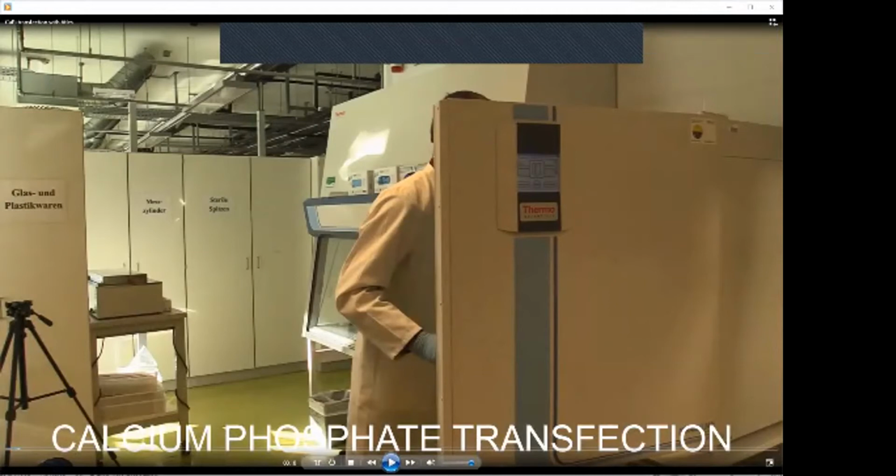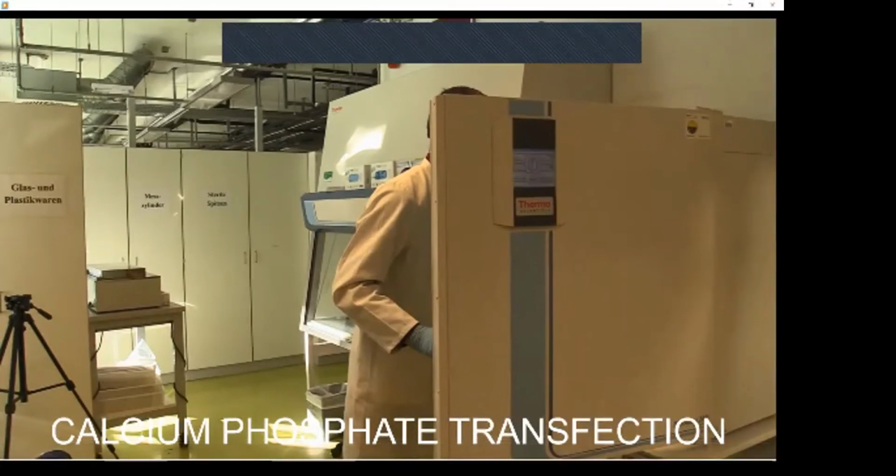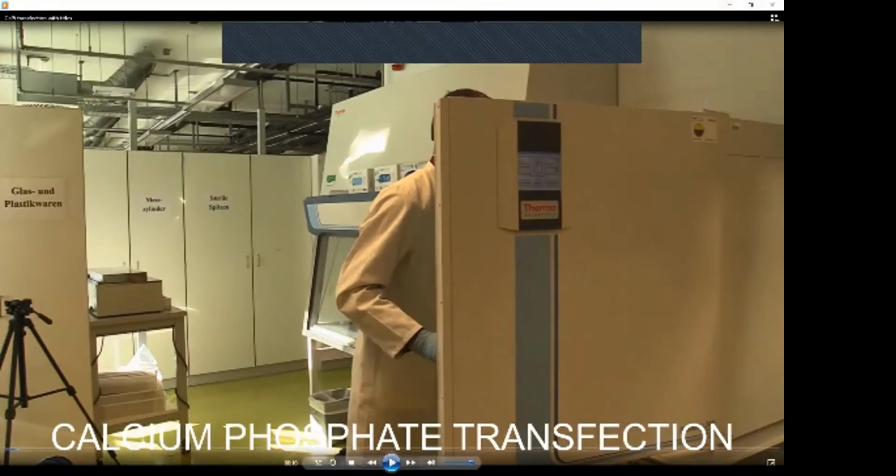If you have any questions, please interrupt me, let me know that you are around and you don't understand something, then I will try to explain it right away. So the first step was seeding of cells. What you have done yourself, you know that we have these knockout MEFs, and that we have seeded 150,000 cells per milliliter of medium in each well of a 24-well dish.